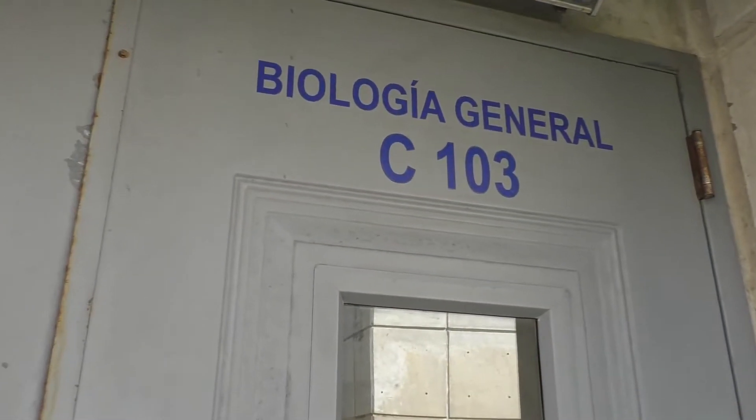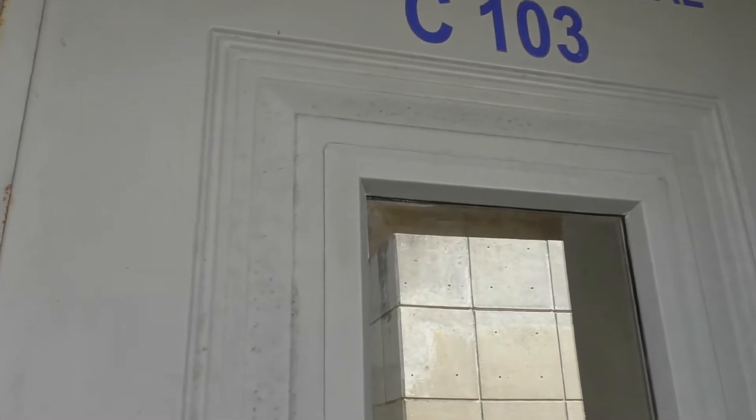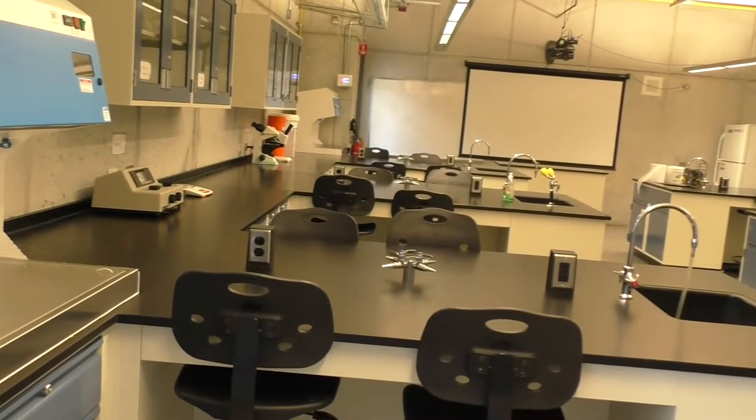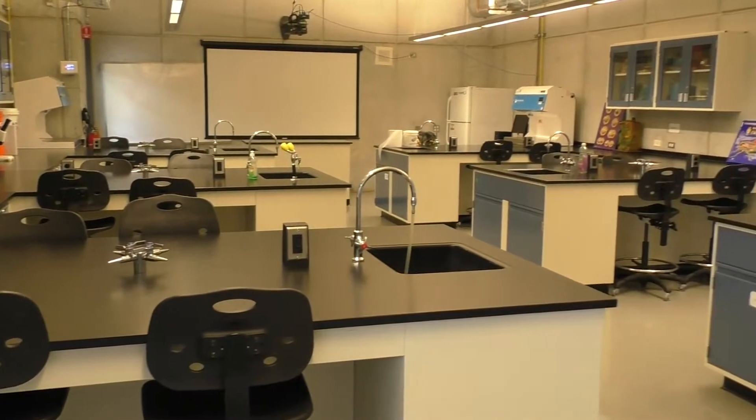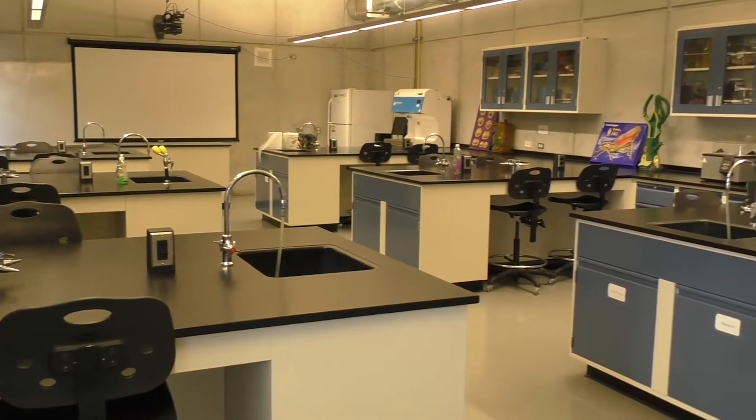Welcome to the General Biology Lab C103. In this lab, the students perform the practical exercises of the courses General Biology I and General Biology II.